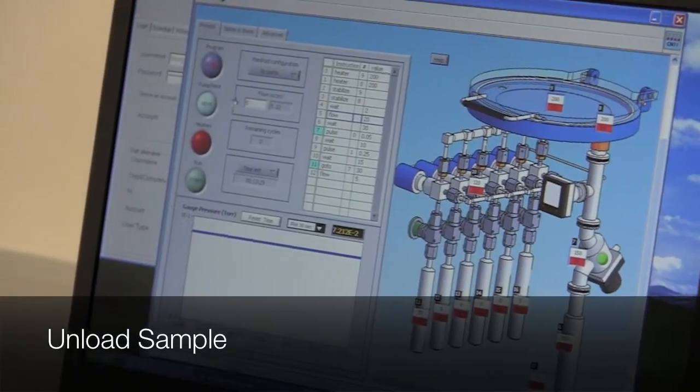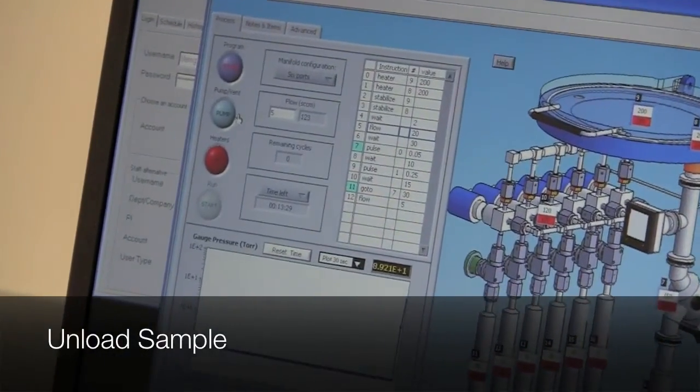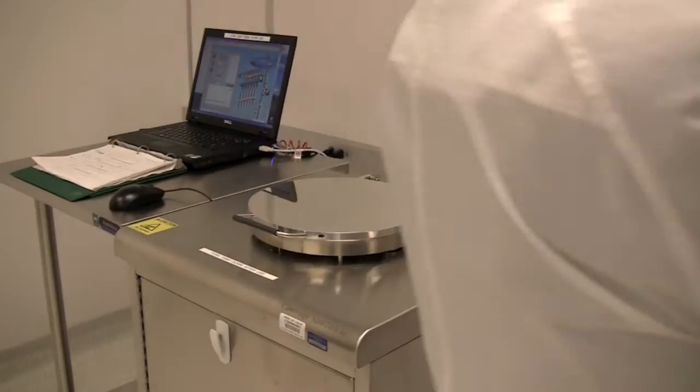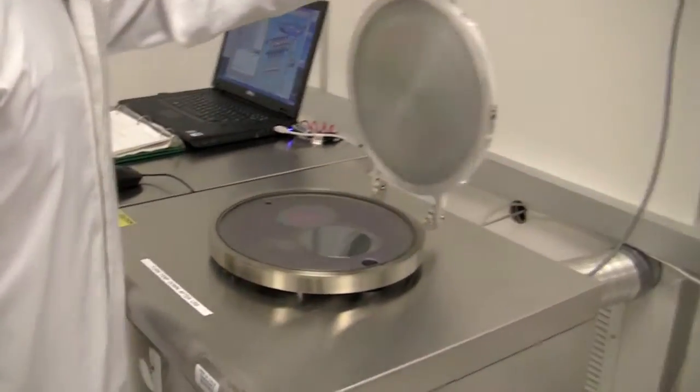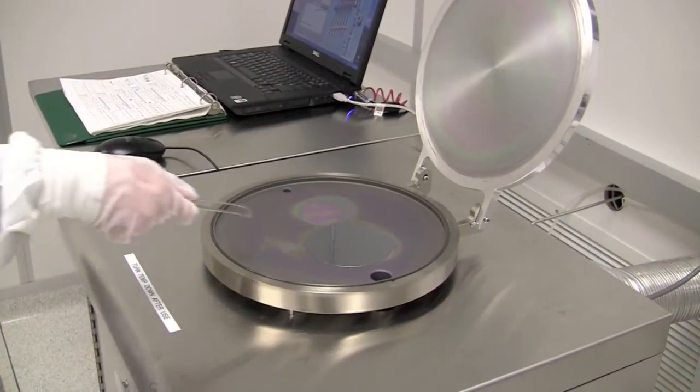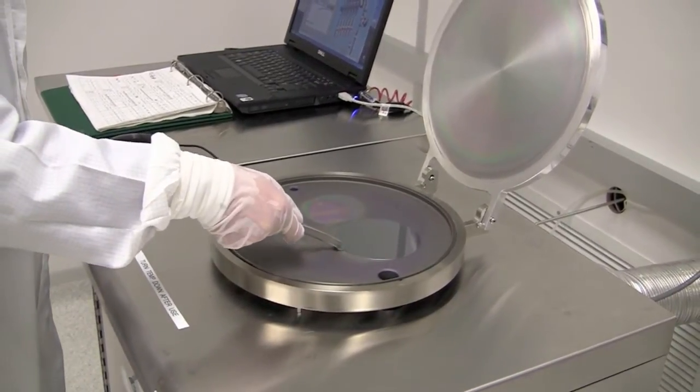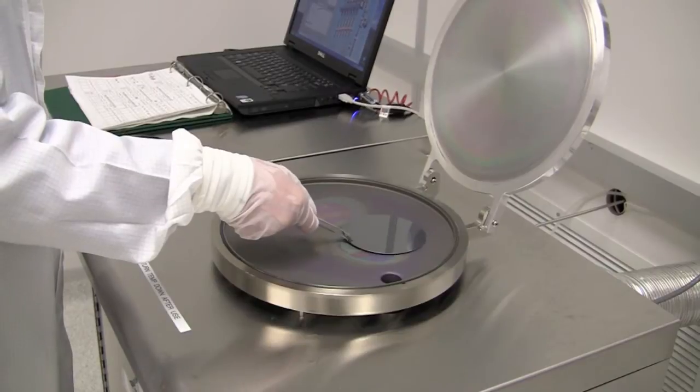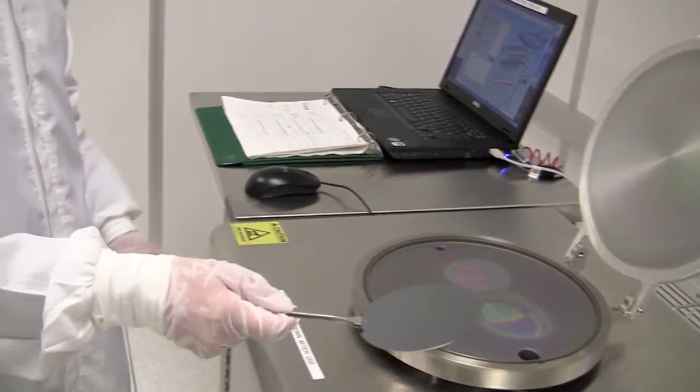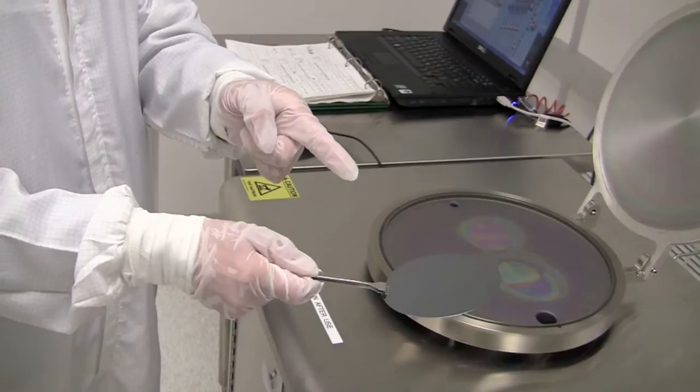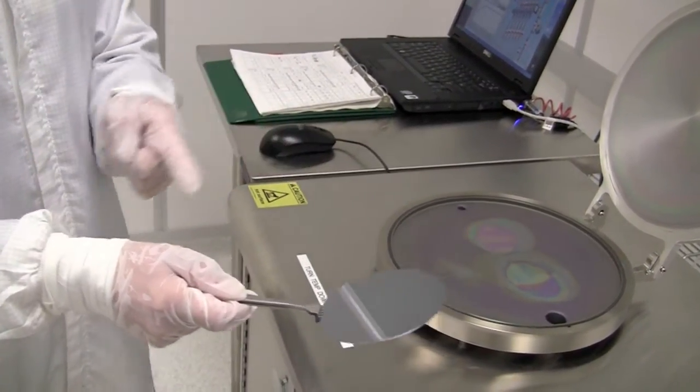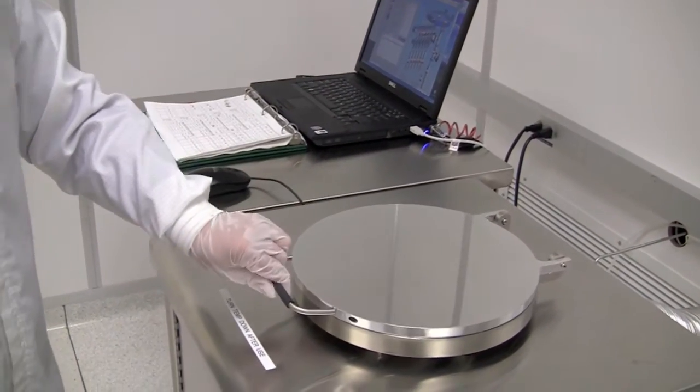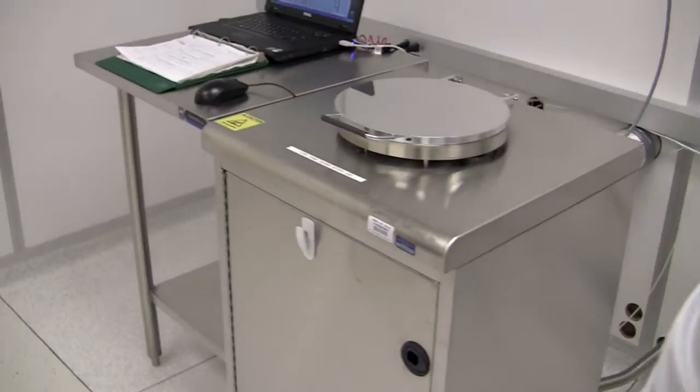Once done, click the vent button to vent the chamber. Put aside the metal shield. Open the lid. Very carefully remove the wafer with a clean metal tweezer. Remember, it is very hot, 200 degrees C. Make sure you put it in a clean safe place. Close the lid. Put back the metal shield.